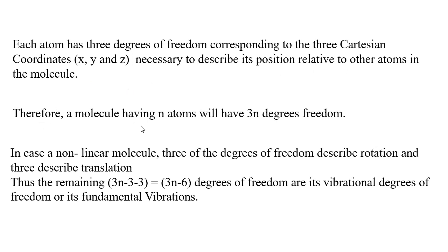Therefore, a molecule having n number of atoms will have 3n degrees of freedom. In the case of a non-linear molecule, 3 of the degrees of freedom describe rotation and 3 describe translation.